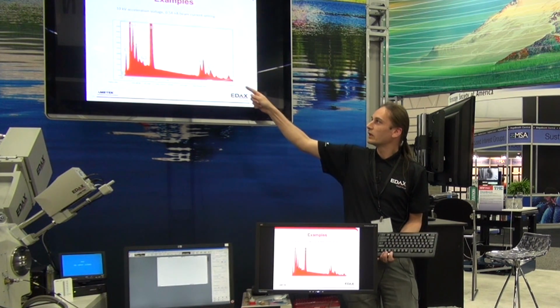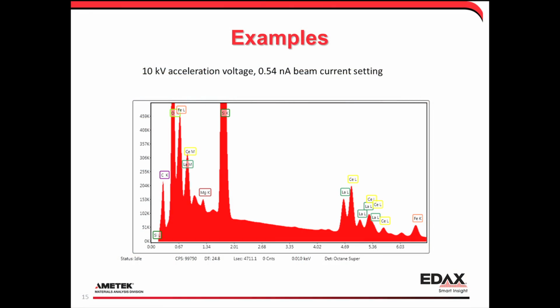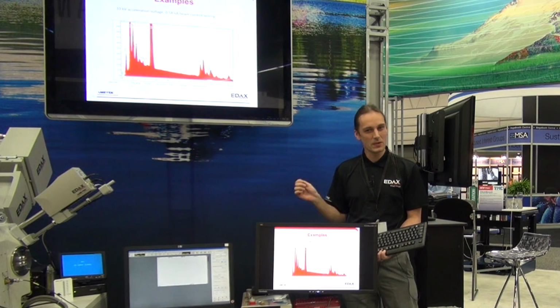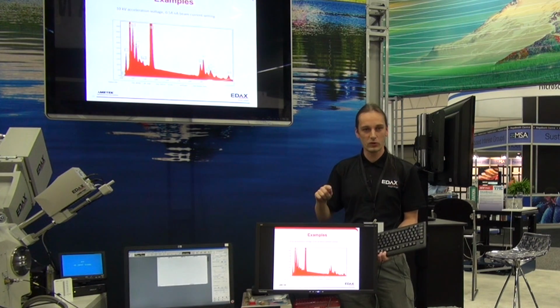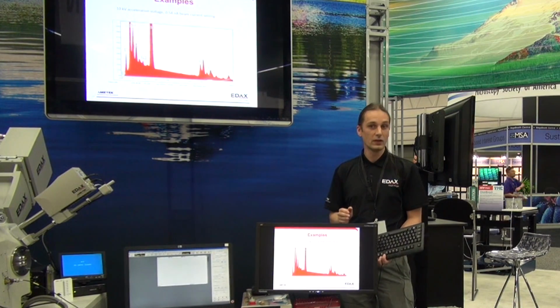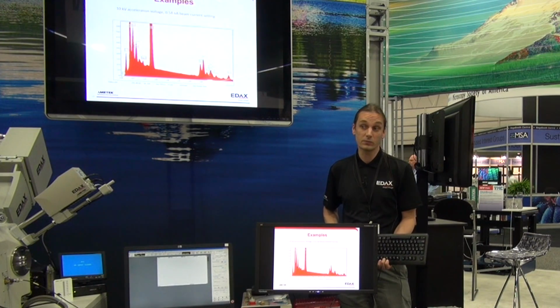So even though that looks like an intense peak, start by looking at the background. So subtract the background. Now the peak is suddenly not so intense anymore. And then divide that peak into two different elements, because that's a combination of lanthanum and cerium. Then you don't have very many counts down there. So that's why the maps are more noisy. And this is a challenge of going to low energy. You get fewer counts, you get more background. And at this point, every single count you can get to build up statistics really starts to matter.